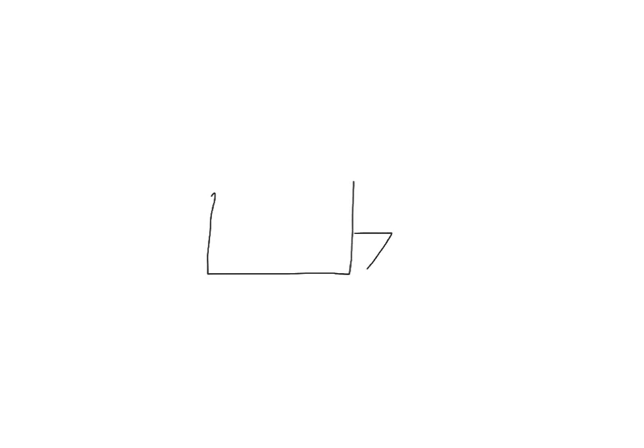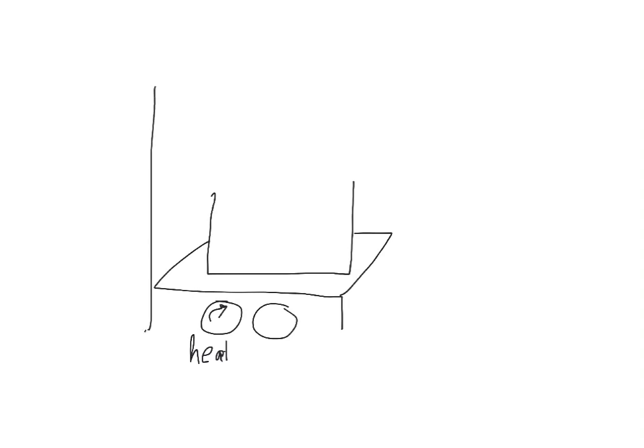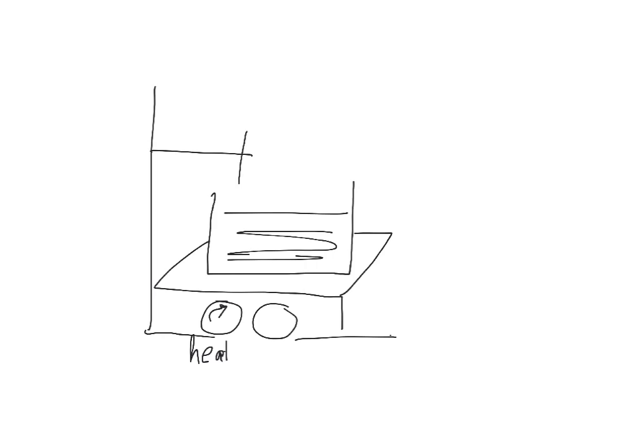You're going to set up a hot plate. You're going to heat it. So the heater part of it should be turned on. You would have a stand. This contains the oil bath or water bath, as the case may be. You would have your clamp. You would have your test tube, and you would fill the test tube with just about a milliliter. So you don't have to fill it in completely. Just about a milliliter of your unknown.